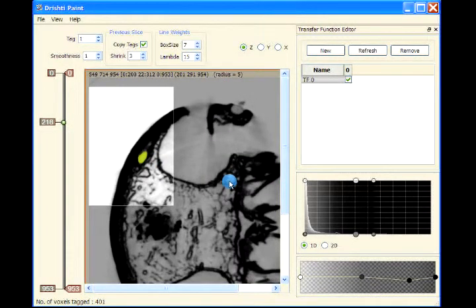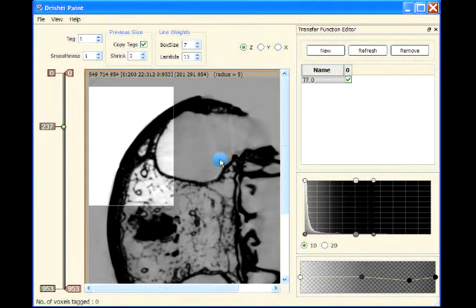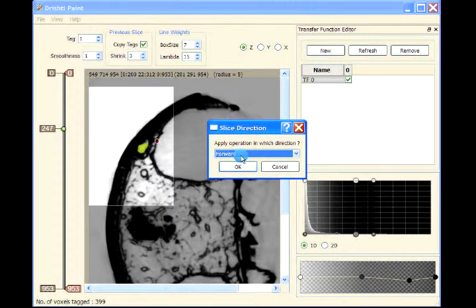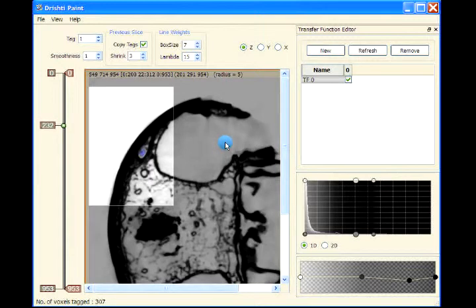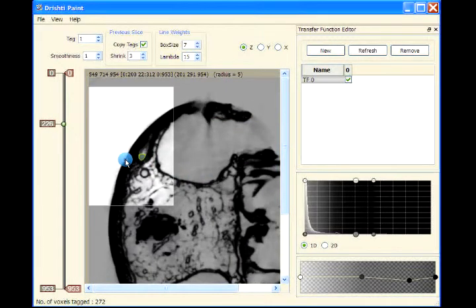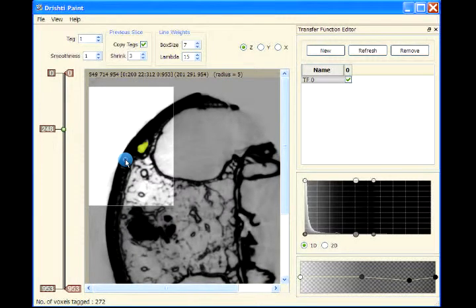And forward. Again we are losing here somewhere, and then it picks up here, tag, go back, tag, okay, and then we can start pushing it forward again.